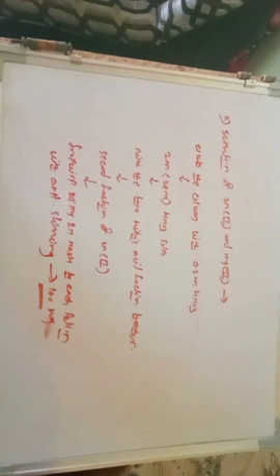So this is all about ion exchange chromatography for separation of a mixture such as zinc(II) and magnesium(II). In the next lecture, we will discuss the remaining practicals of this course.